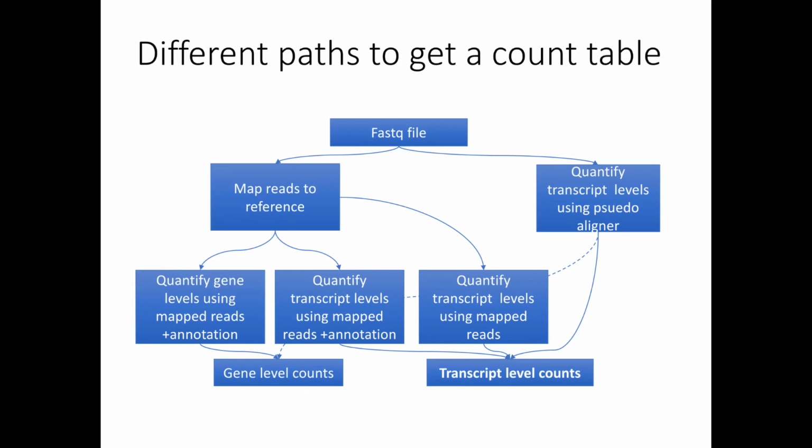And if you don't beforehand have a reason to think that some transcripts, some isoforms, are more interesting than others, I and others mostly think that this extra step of complexity doesn't add anything. It just makes it more fuzzy.